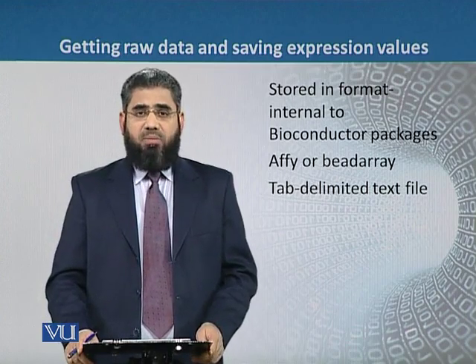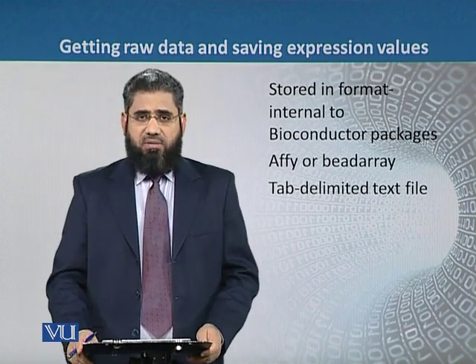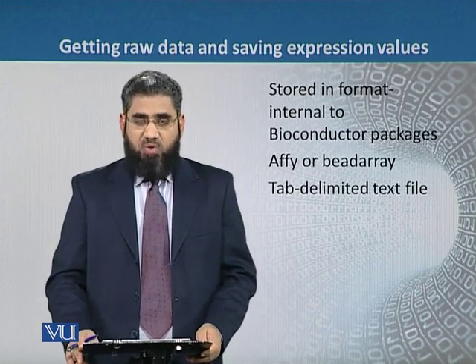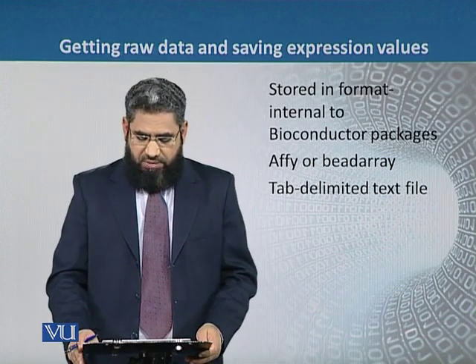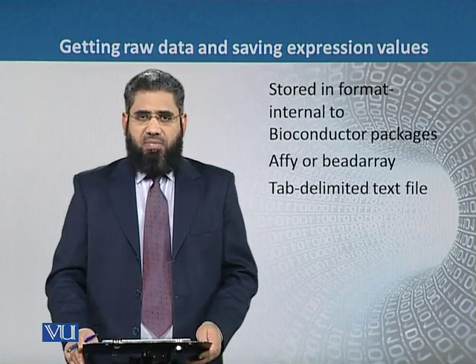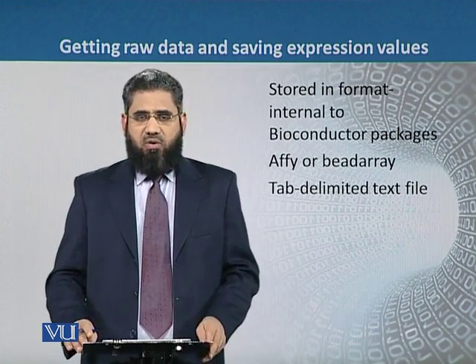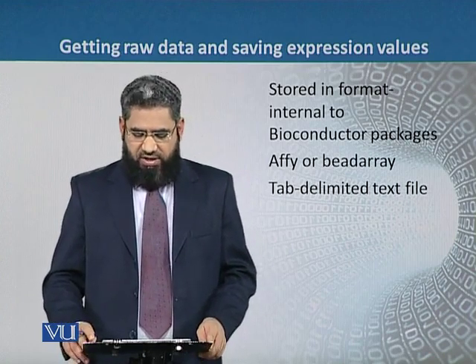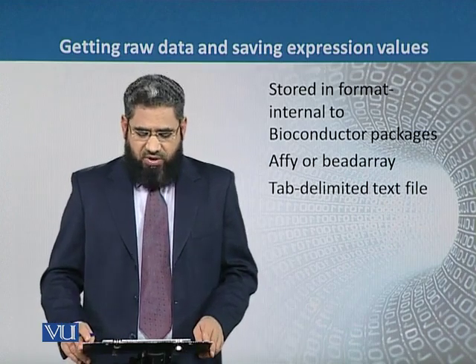And because most of the commands that are present in the Bioconductor cannot read the data that is in the raw form, it is better to use the data that is present in the form of tab delimited text file. And these text files are generated by just pressing the tab button, so that all the values are separated with the help of the tab. And this file can be read easily by the commands that are present in the Bioconductor.